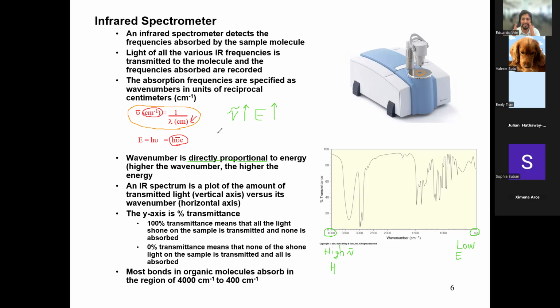You do have to know at least this foundation, right? Because it is going to help you. But what we're going to be doing for the worksheet is I'm going to be giving you guys these spectra, and you're going to have to look at the energies where you see these peaks. And then based on that, you're going to say, well, this really long peak here has a wave number of 3,200. This sharp peak at 1,500. This sharp peak at 1,000, right? 1,000 wave numbers, 4,000 wave numbers, 400 wave numbers. That is how we talk.